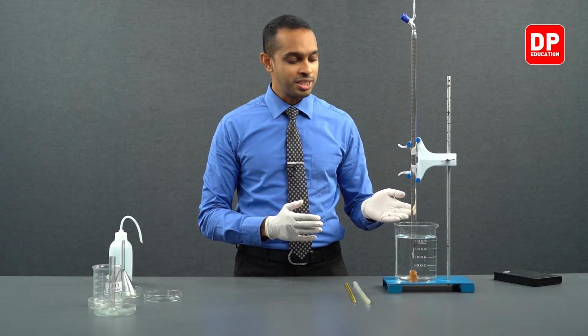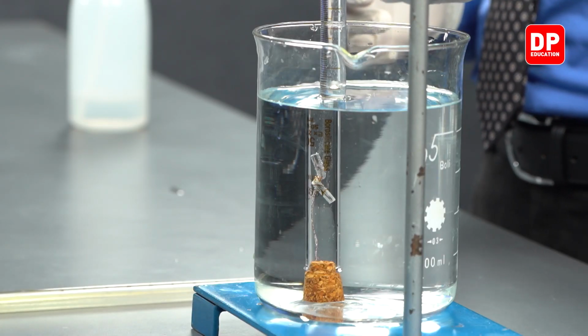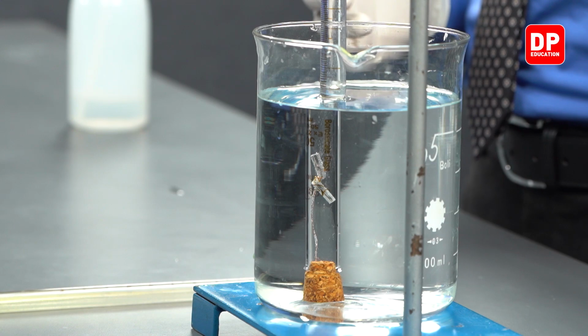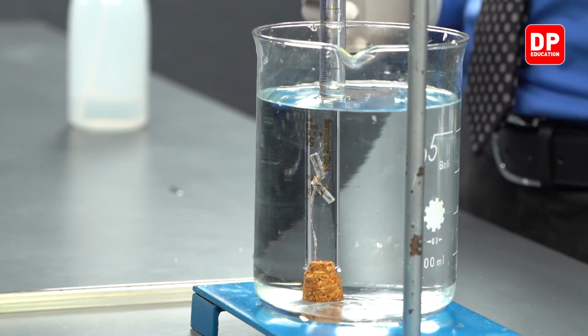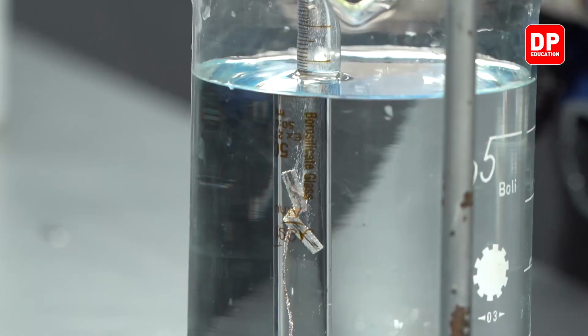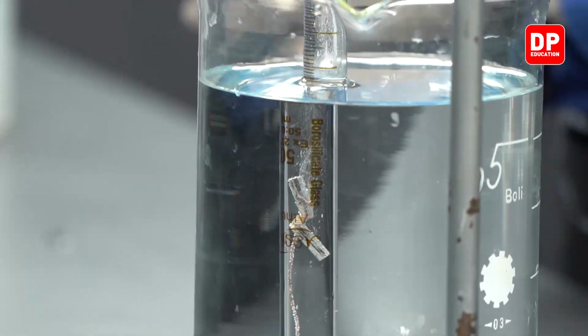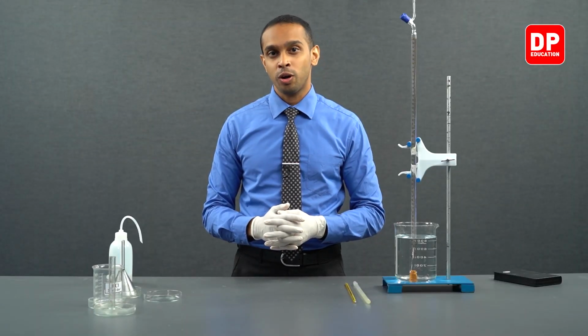Now you can see little by little small gas bubbles are formed around magnesium, and they are going up the burette and collecting at the top part of the burette, which means our reaction has started. After a while, when the reaction has completed, we will come back to take the gas volume measurement.